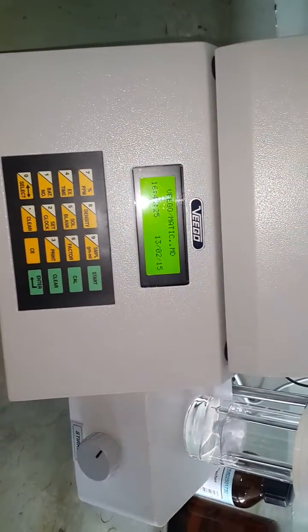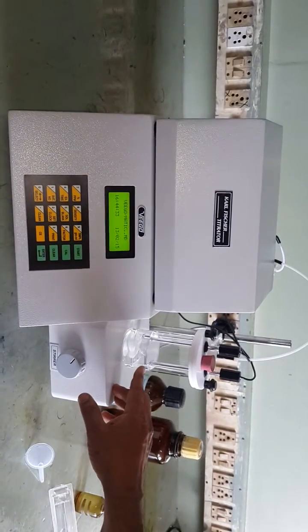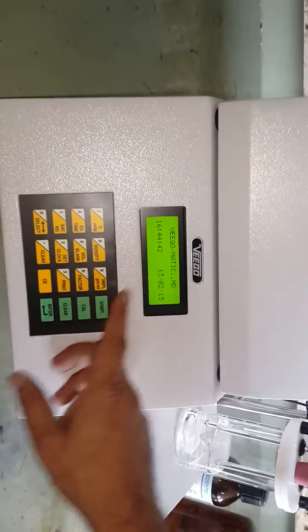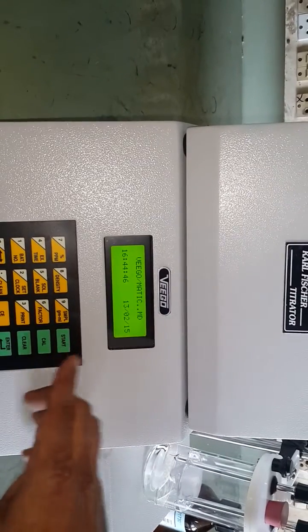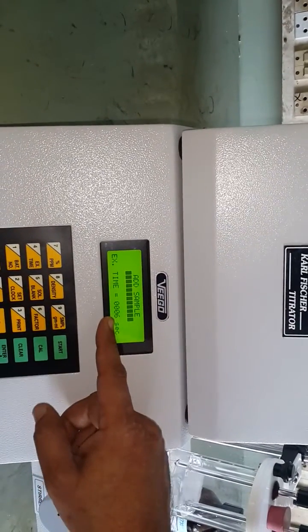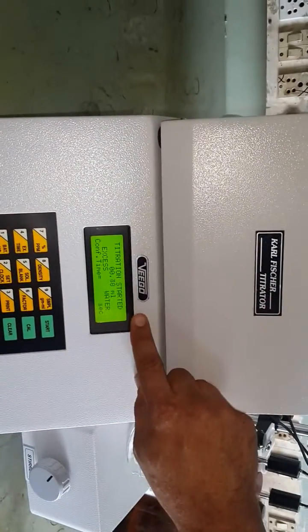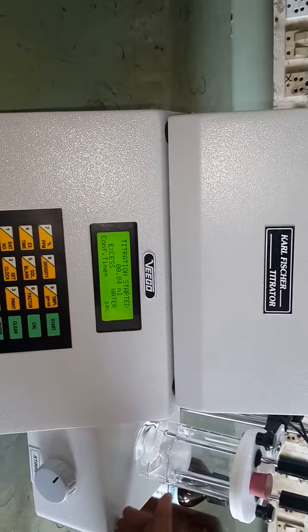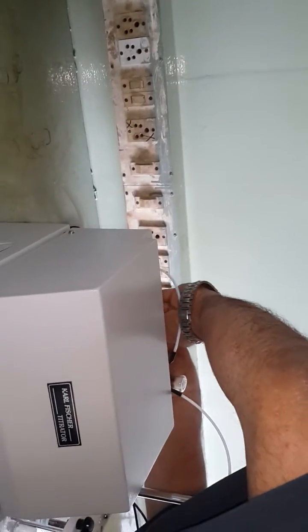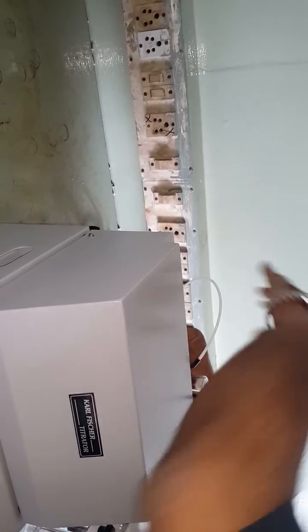Karl Fischer titrations are performed in three stages. The first stage is to neutralize the blank water present in the methanol — this methanol contains about 0.05% water initially. Press the start key; the message 'add sample' will appear. Without adding any sample, press the start key again. The extraction time counts down from 10 seconds to zero, then the titration starts, showing the message 'excess water' indicating the presence of water in the methanol.